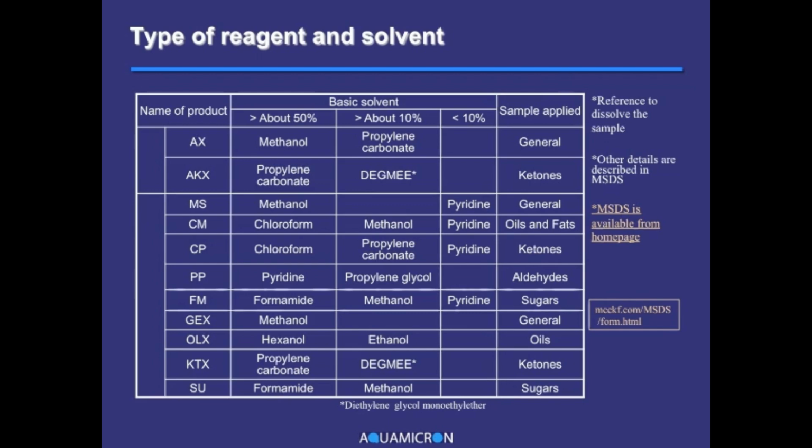Thirdly, chloroform and pyridine are regulated by the Chemical Substances Control Law. Thus, their concentrations in the products are indicated in two significant numbers, both on the labels and in the MSDS, for customers to calculate the quantity consumed in accordance with the Pollutant Release and Transfer Register Law.